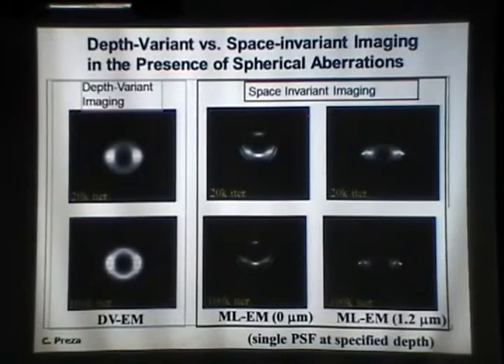Here's a comparison where we have the result with the depth variant at 20,000 iterations and at 100,000 iterations. So it takes a lot of iterations, a lot of computation, to recover the north and south poles of the structure, right? That's the difficulty, because remember, that's where we have the significant loss of resolution, where we get the stretch along Z. But eventually you're able to get it.